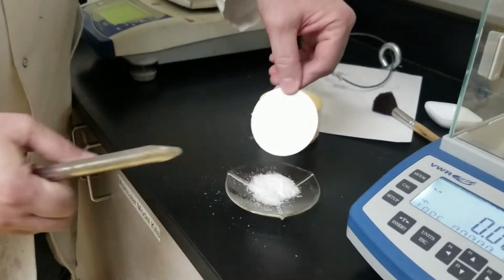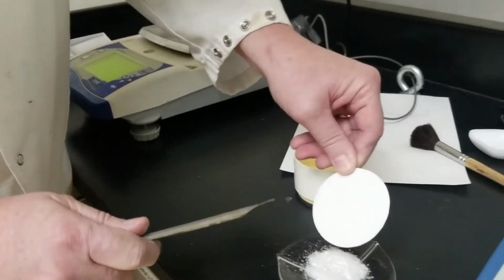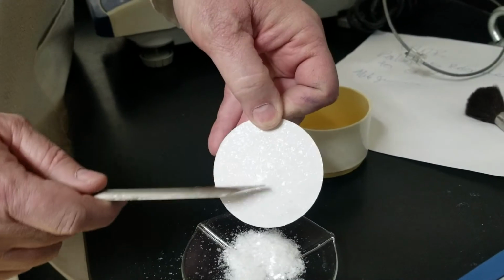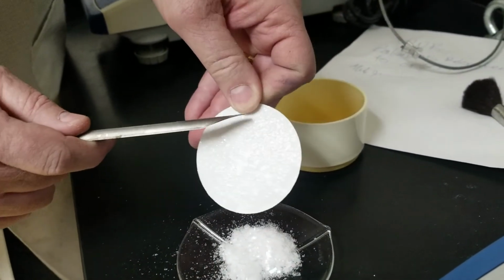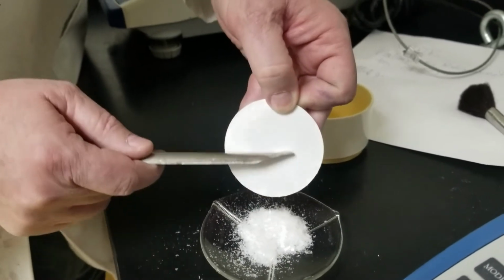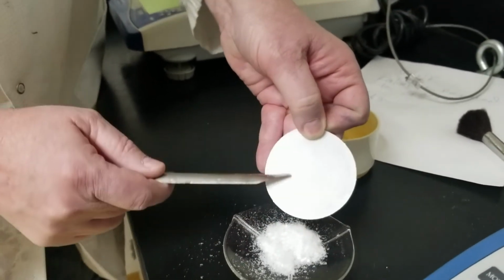Okay, you'll see even this paper is sparkly with little crystals. I don't know if you guys can see the sparkle. Oh, there it goes. You see the sparkle? Yeah. We're going to try to knock off as much of that sparkle as we can without scraping paper onto our product.